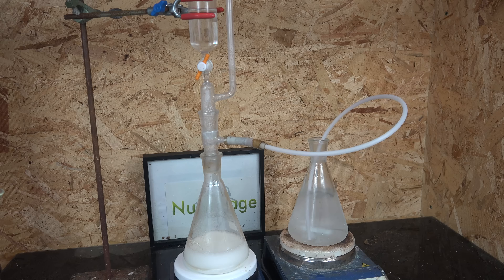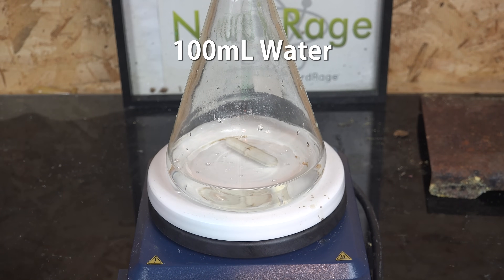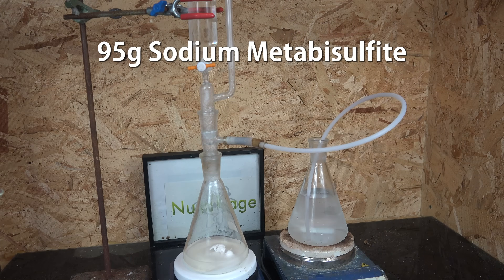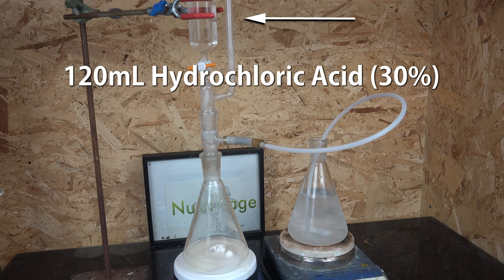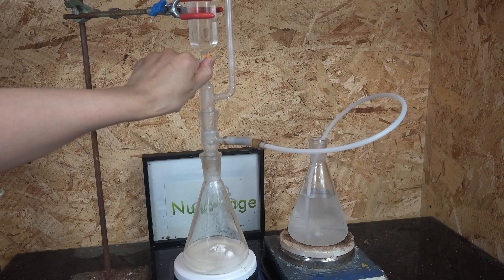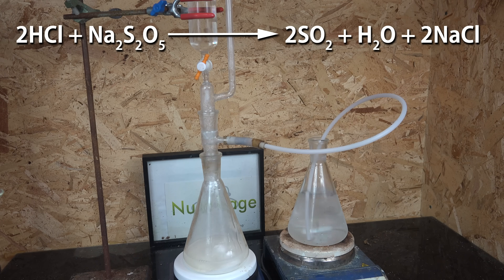So that leaves the final and most expensive method: sodium metabisulfite acidification. To make the generator we start with 100 mL of water, then add 95 g of sodium metabisulfite. On top of this we set up a gas adapter and pressure-equalized dripping funnel. To the funnel we add 120 mL of 10 mol (30%) hydrochloric acid and seal it. You can multiply the ratio to whatever you need for your application. To use the generator we just open the valve and drip in the hydrochloric acid. The acid reacts with the sodium metabisulfite to generate sulfur dioxide and salt, and we can then lead the sulfur dioxide into whatever reaction we want.